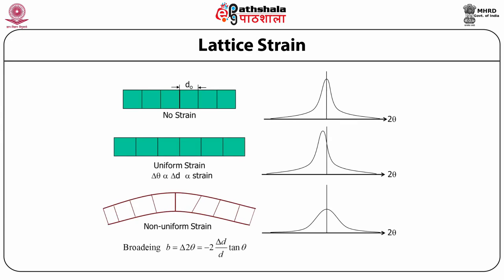When crystallites are less than approximately 1000 angstrom in size, appreciable broadening in the X-ray diffraction line occurs. These regions may in fact correspond to the actual size of the particles. At other times, however, these regions form domains in the larger particle and may be a distinguishing and important feature. In either case, the observed line broadening can be used to estimate the average size. In the simplest case, where the particles are stress-free, the size is estimated from a single diffraction peak. But in those cases where stress may be present, a more robust method involving several diffraction peaks is required.